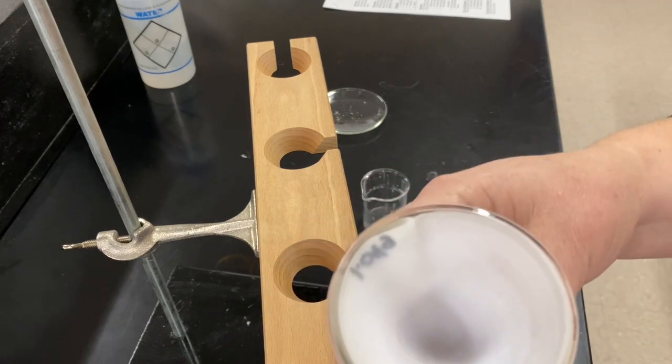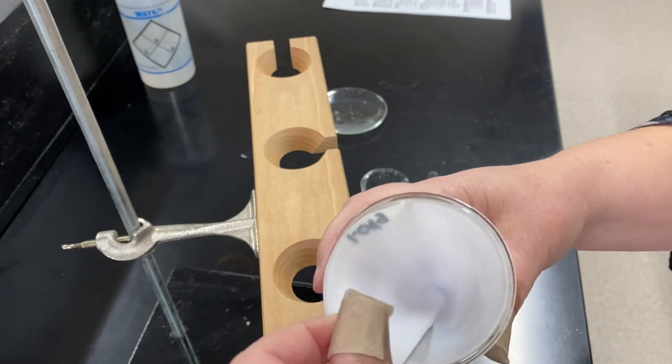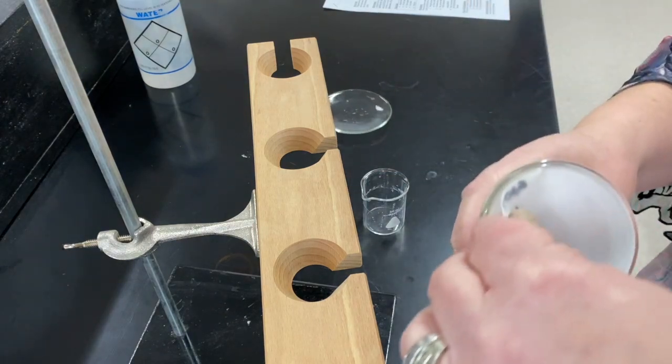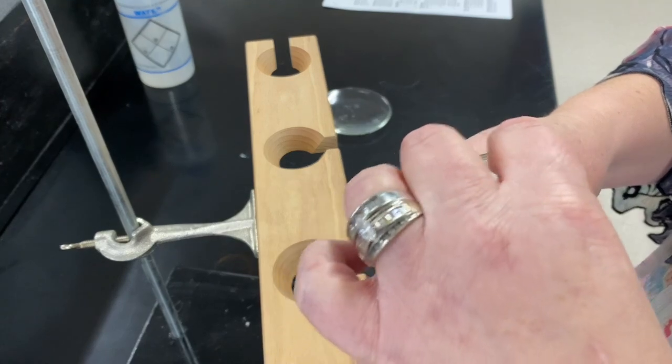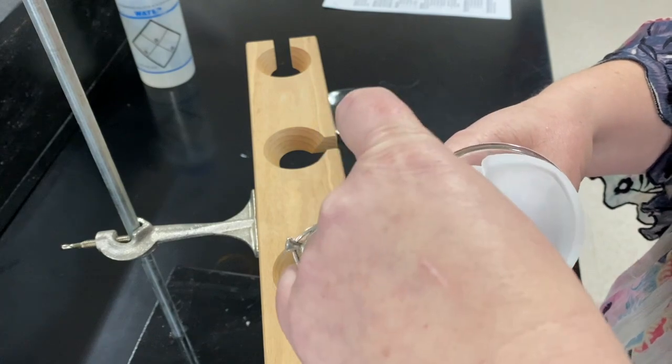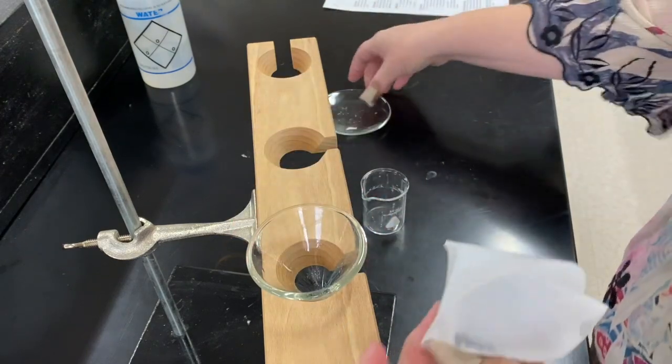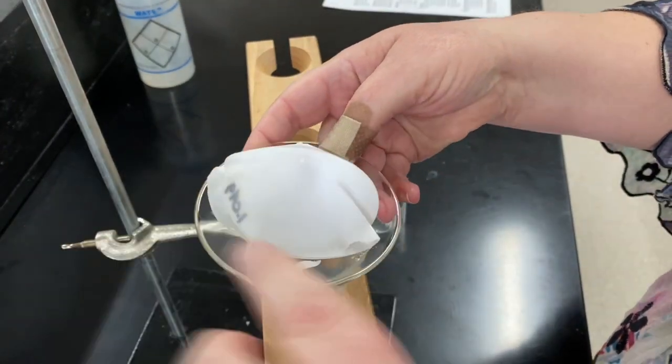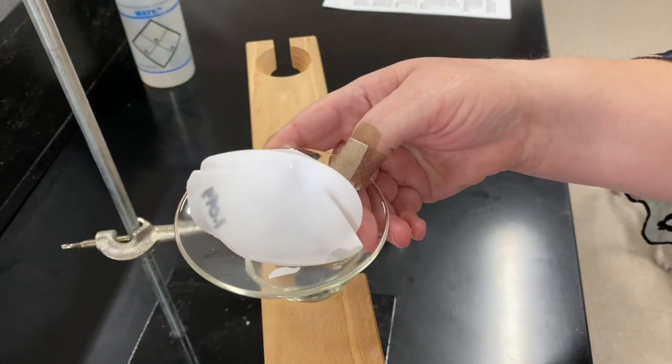So what we're going to do now is we're going to take the filter paper out very carefully. It's delicate and rips. I'm going to save that piece of paper. Let's try this again. It's very delicate. Okay, so we're going to take this out. Got it. And we're going to place it on a watch glass. I want to leave that other piece there because that's part of the mass of the paper that we need to consider.